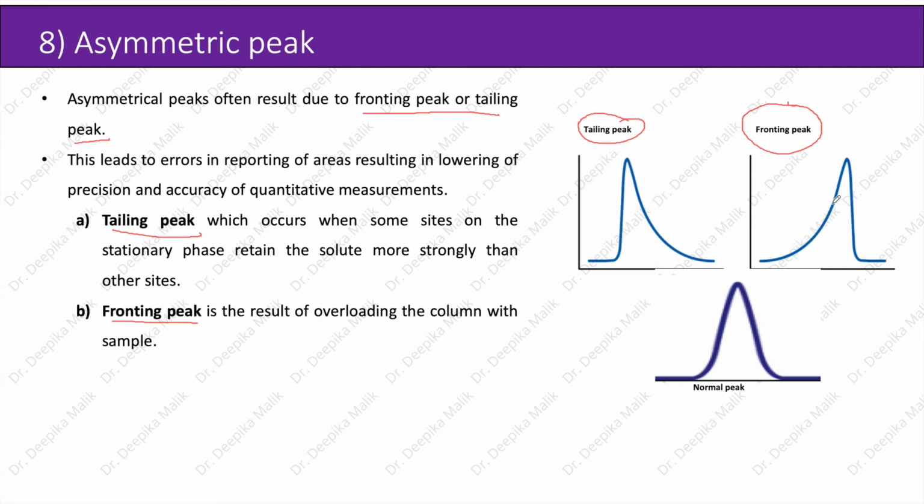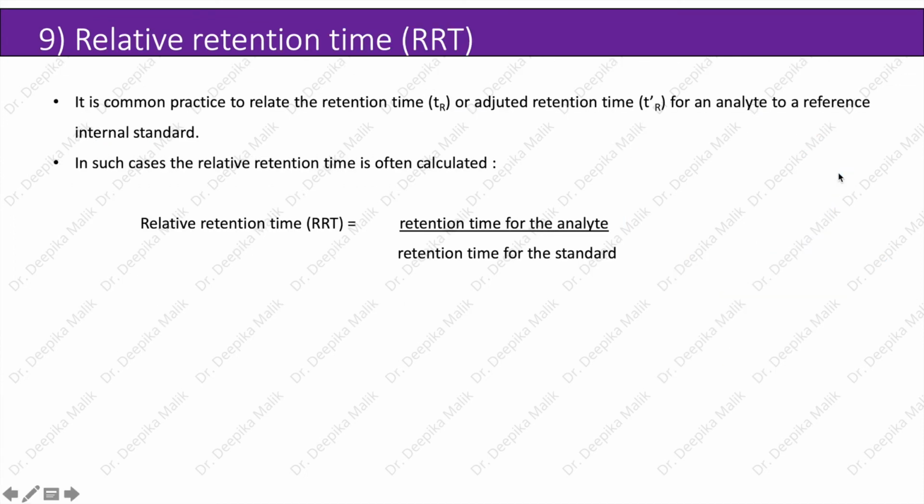Next parameter is the relative retention time or RRT. It is common practice to relate the retention time or adjusted retention time for an analyte to a reference internal standard. In such cases, the relative retention time is often calculated as retention time for the analyte divided by the retention time for the standard.